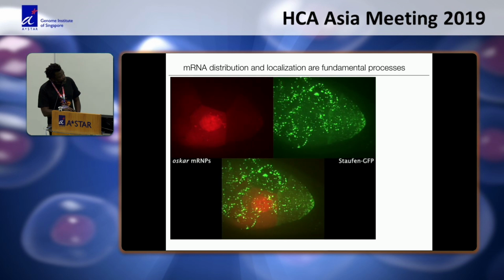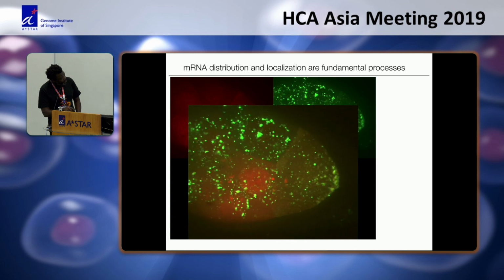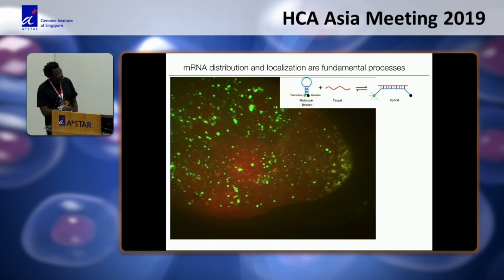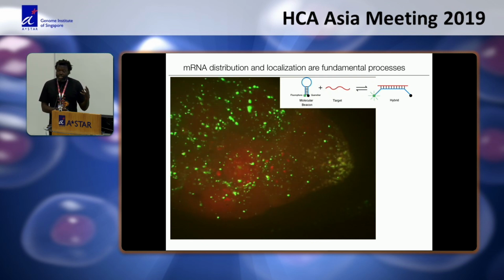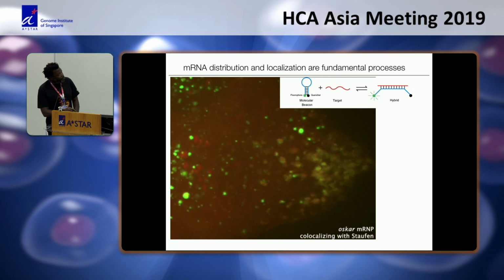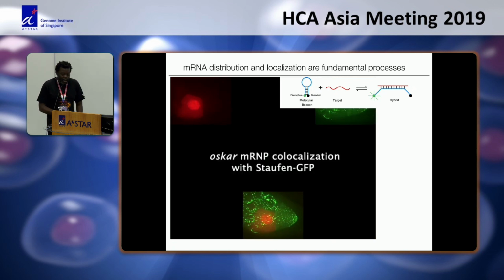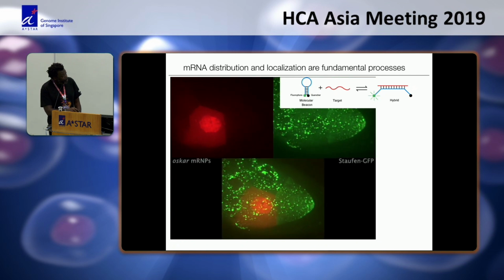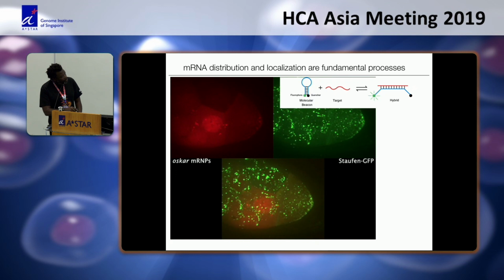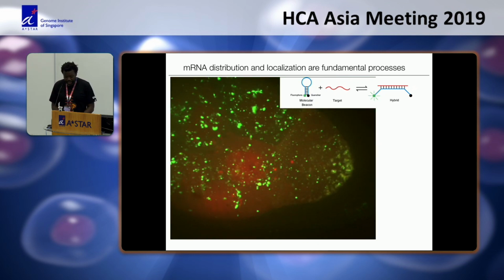Understanding this change in RNA positioning and the direction of this Oskar RNA to the posterior is important, because that in turn results in the formation of the posterior part of this egg. Using this kind of probe technology of molecular beacons that was developed in our PhD lab, we can really understand in time where these things occur, and in a way we can reveal cellular state.